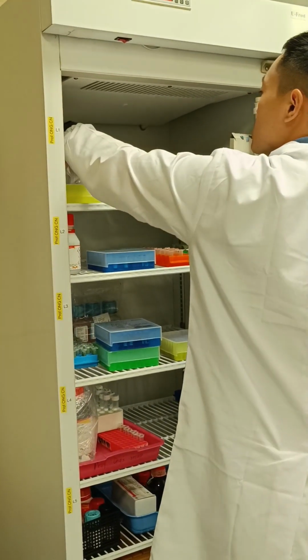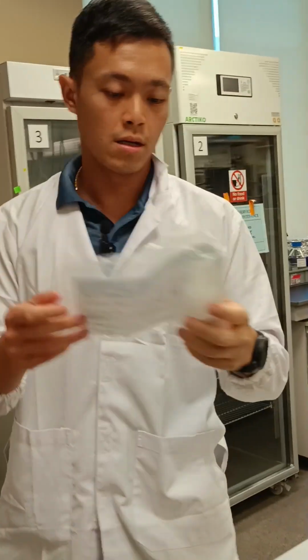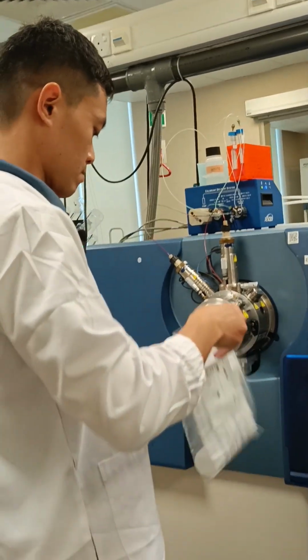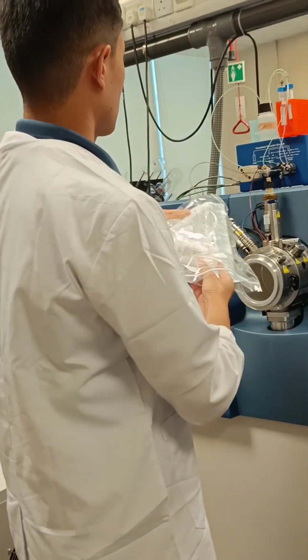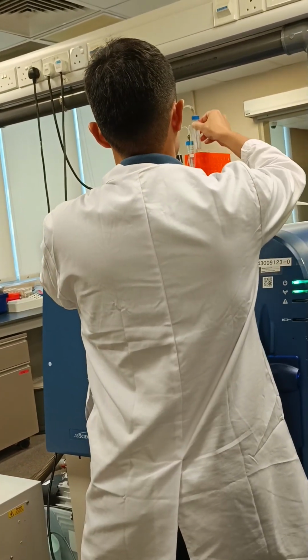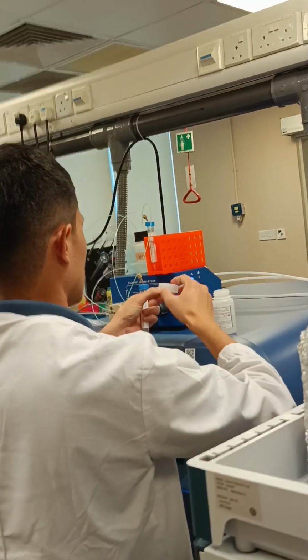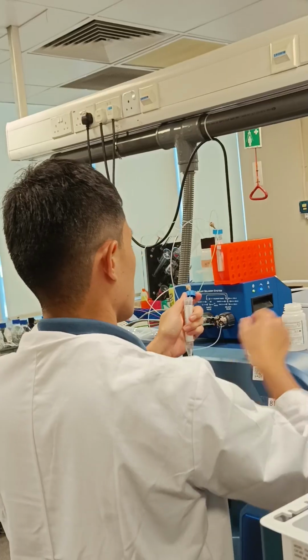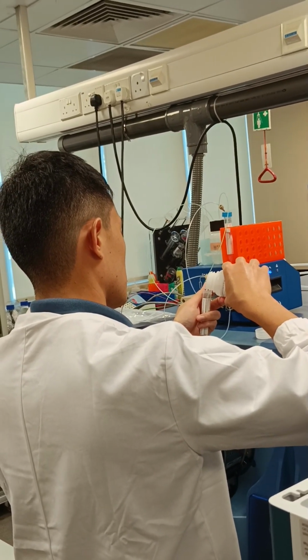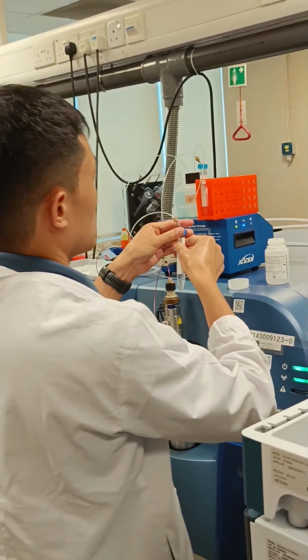Positive, negative. So this is the APCI negative calibration solution.